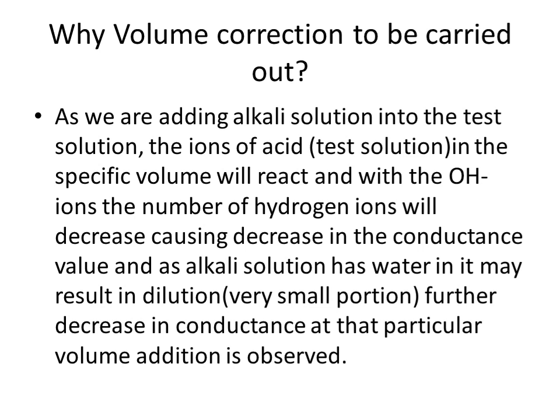H plus ions will be replaced by sodium ions, and there will be a reaction between them. So HCl plus NaOH gives you NaCl plus water. So what has happened? The number of H plus ions will decrease automatically due to neutralization of H plus ions. Due to neutralization of H plus ions, there will be a decrease in the conductance.